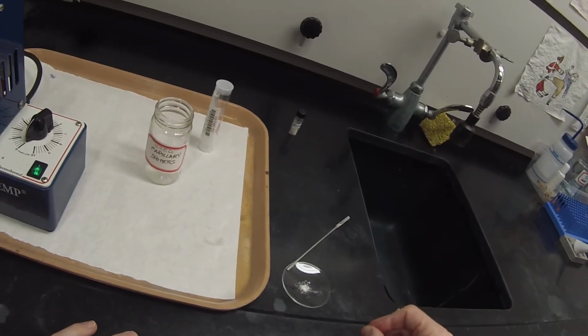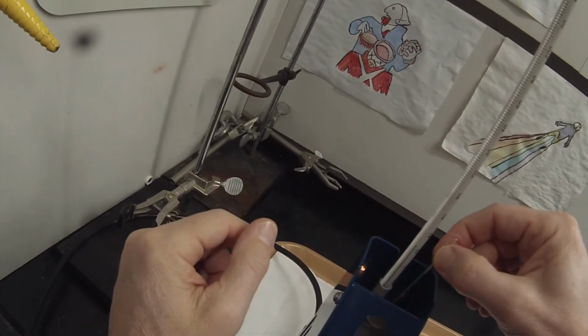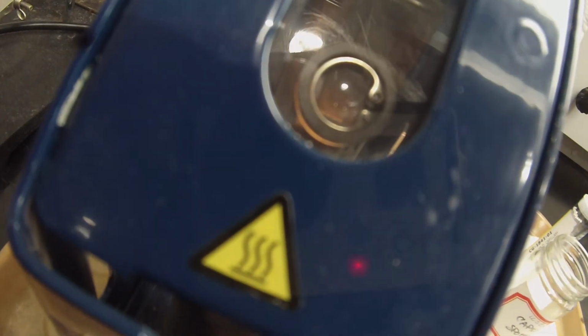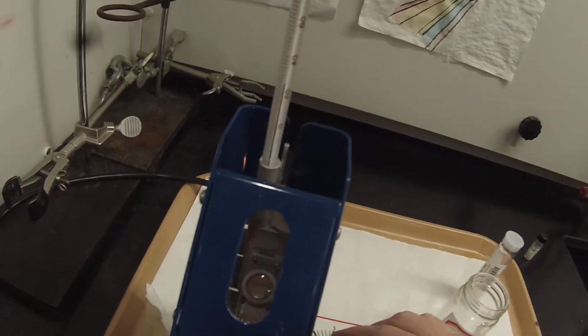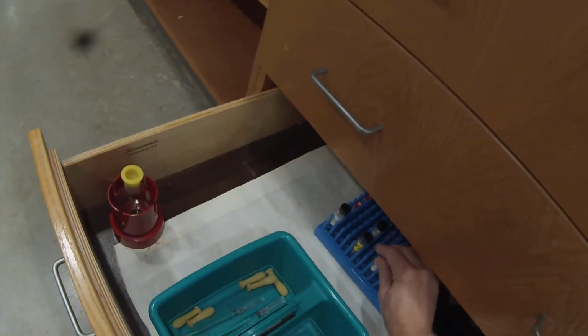We don't want too much, or it can take longer to melt and extend our range. We can insert that into the central slot. And then maybe you can see it if the camera is lined up right through that magnifying glass. And right now our temperature is at 25 degrees. So we're going to raise this up to about 3. And I have no idea if that's a good setting or not. I hope it's a good setting. And if it's not, we'll run another sample.